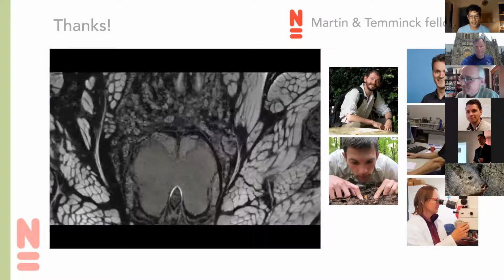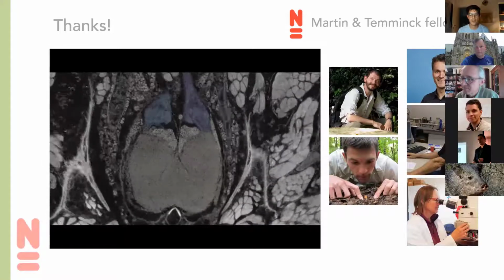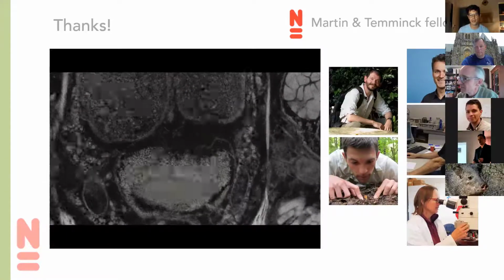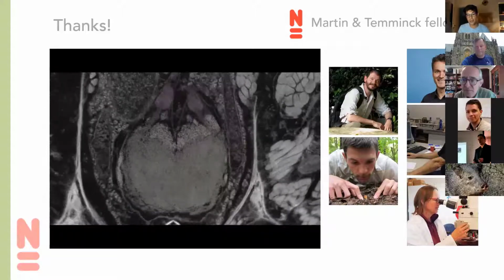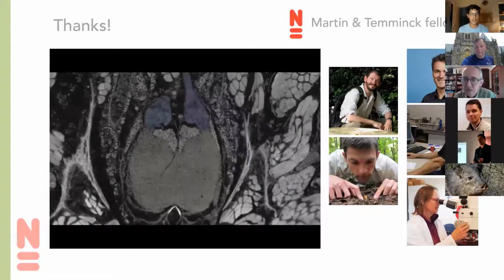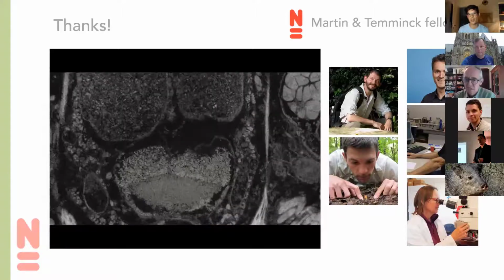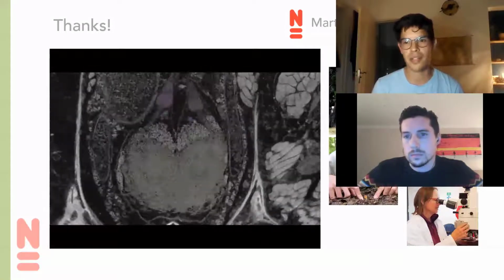Yes, when the tissue shrinks, it can deform the organs, and this is especially seen in the softest tissue, like the central nervous system that I was looking at, and also in the musculature. And yeah, so the shape that you are looking at in the reconstruction is not the real shape that you would see in situ if the specimen wasn't dried. So that's the kind of artifacts that it can create.